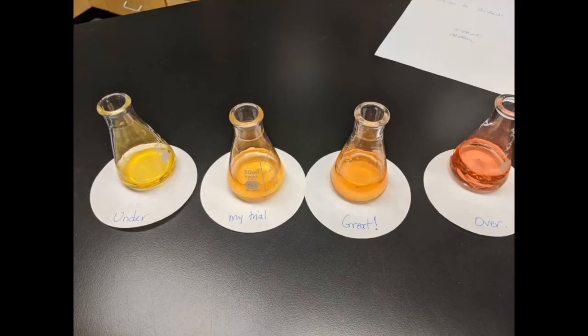There you have it — my trial is second from the left. It is that nice peachy color: not yellow, which would indicate I haven't added enough hydrochloric acid, and not pink, which is when I've added too much — right there in the middle. You can see my measurements on screen: the first trial was 14.8 milliliters, and this trial was less than that because we're in the correct range.